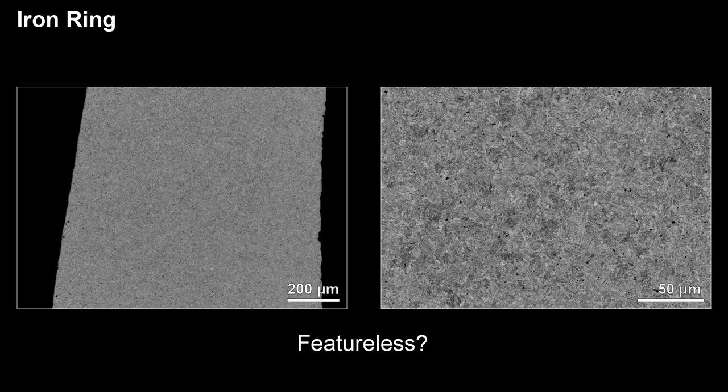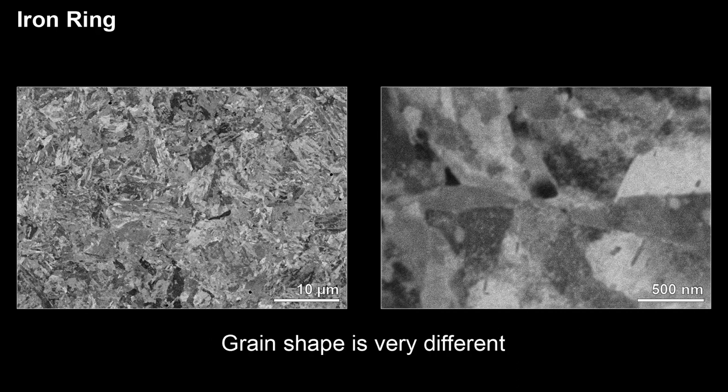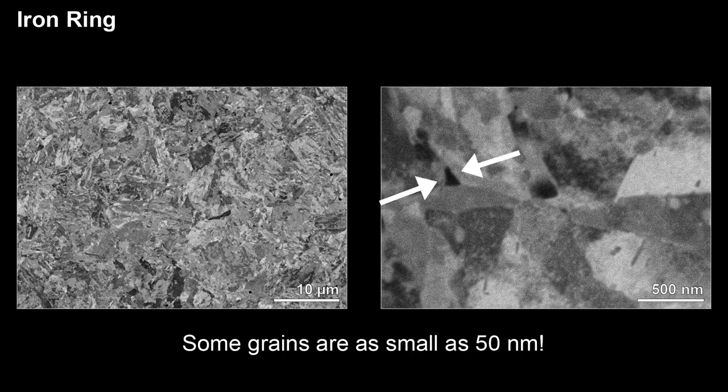Now let's look at the iron ring. On the low magnification image, it appears to be featureless, but as you zoom in we can see some grain features, though the grains are much smaller than the ones found on the stainless steel ring. With increasing magnification, we can see that the shape of the grains are quite different compared to the stainless steel. This is most likely due to the differences in the manufacturing condition and the chemistry of the ring. At very high magnification, we can see some grains can be as small as 50 nanometers.